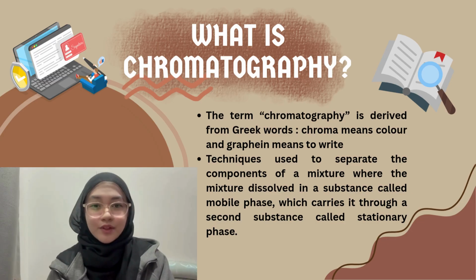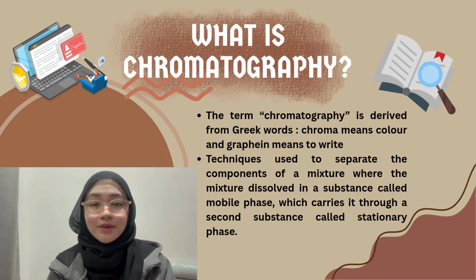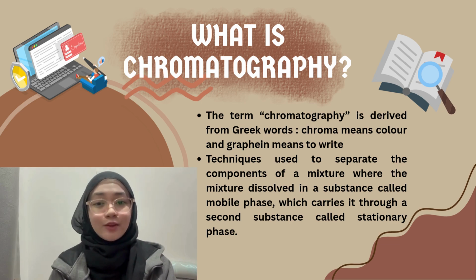Let's start with the word chromatography, which is derived from the Greek words chroma, meaning color, and graphein, meaning to write. Originally, it referred to color writing. So what exactly is chromatography?